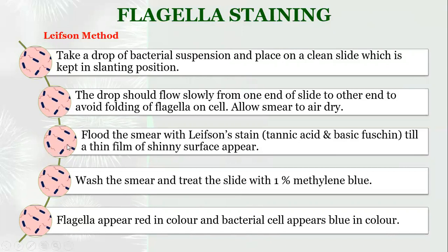The pink color is due to the Leifson stain and the blue color is due to methylene blue. Both have to be used, as neither stain will stain both the bacterial cell and the flagella. So two different stains are used to stain the flagella and the bacterial cell separately.